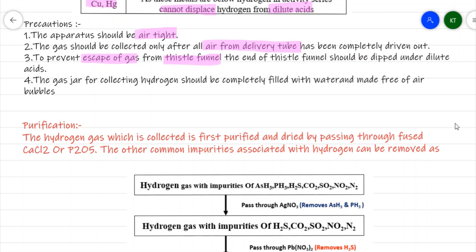The gas jar used for collecting hydrogen gas should be completely filled with water — there should be no air bubbles left. If an air bubble is present, it may lead to an explosion. We must ensure the collecting jar is completely filled with water to minimize the chance of air bubbles.